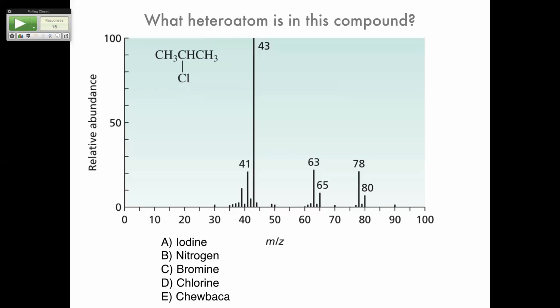This would be a, which would be farthest downfield? Closer to 40. The one closer to 40. Okay, now look at this one. What would the splitting of this be? What would the ratios be? This would be 6 to 1, right? Who would be farther downfield?